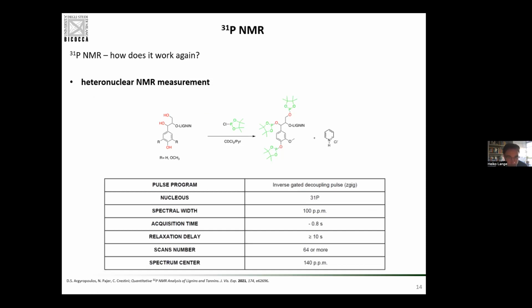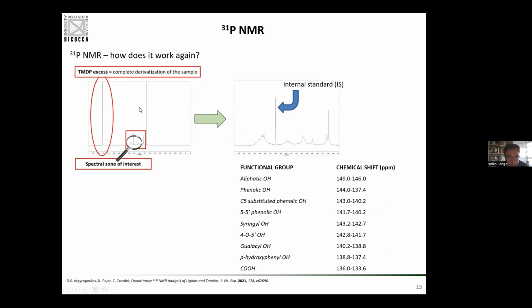That is water bound with hydrogen bonding between hydroxyl groups in the lignin, etc. So I must see this. There is no way that I don't see water in a lignin. Okay, so I must see this. And then this little thing that I left in the middle is basically the spectra of my lignin.